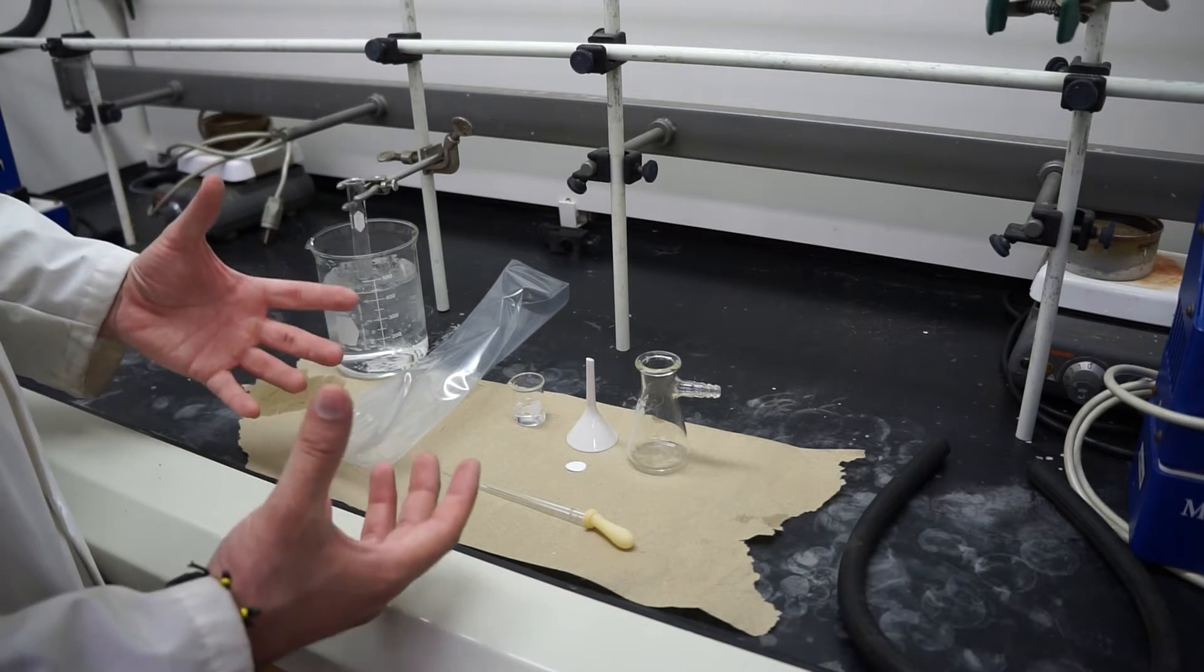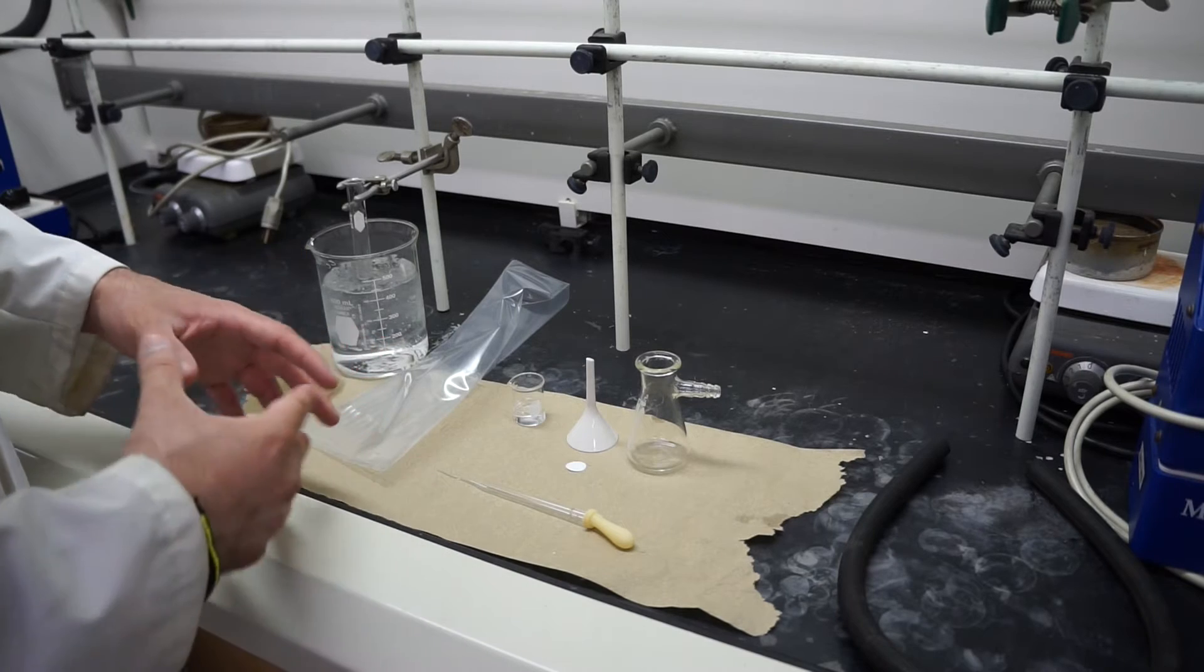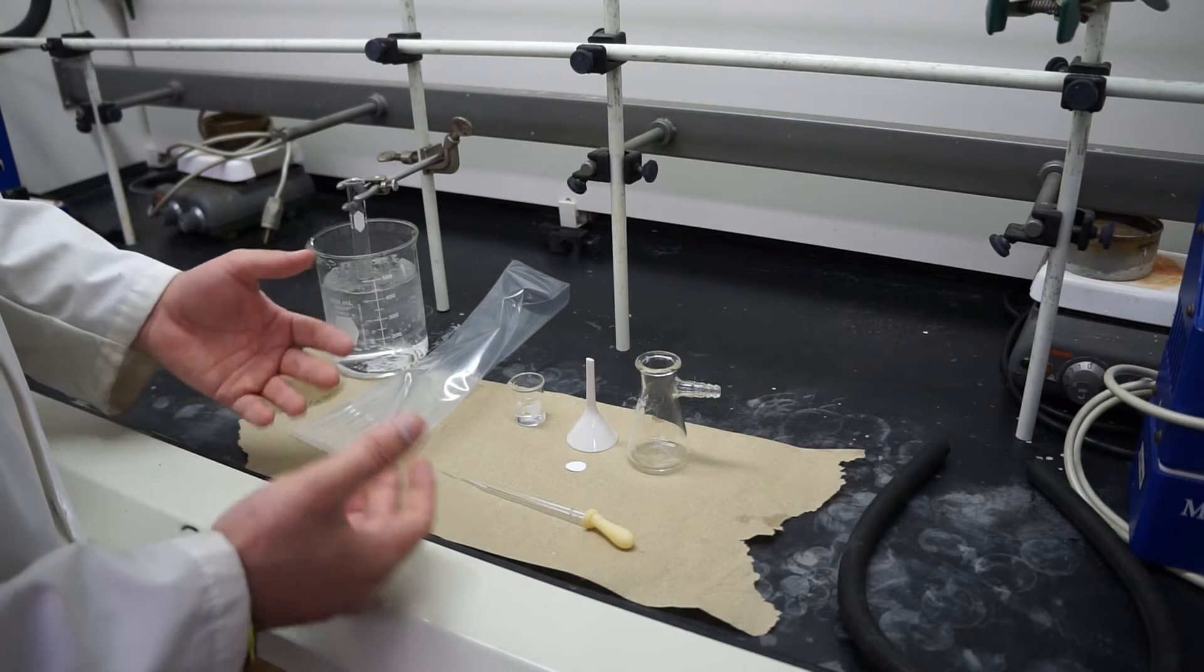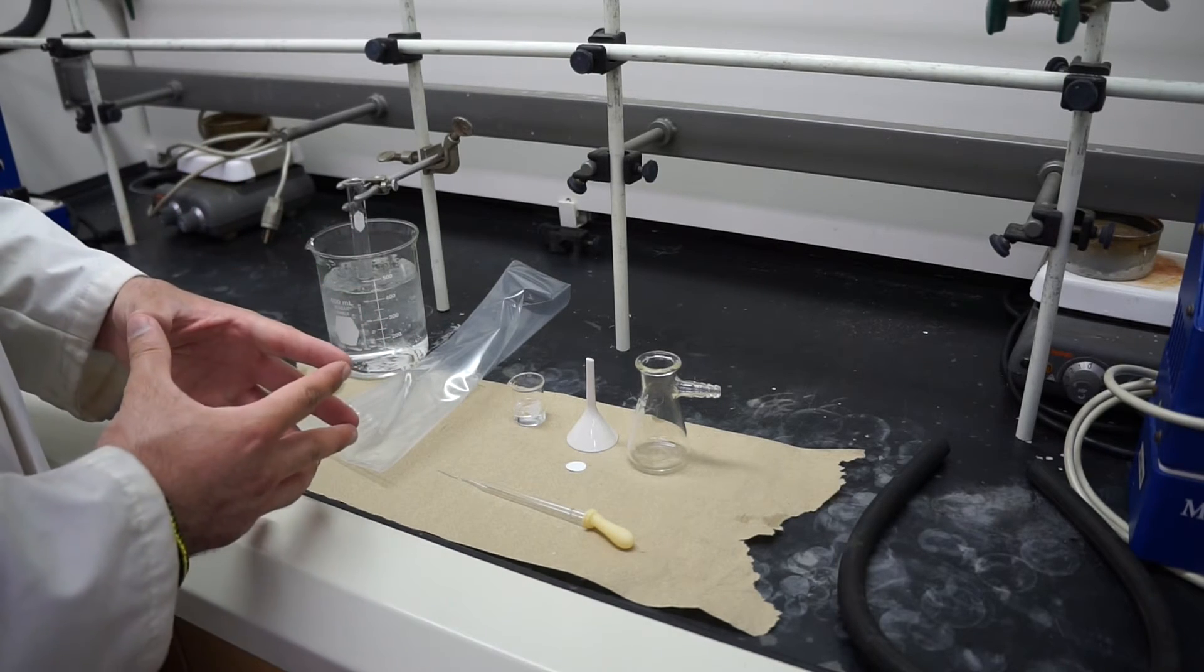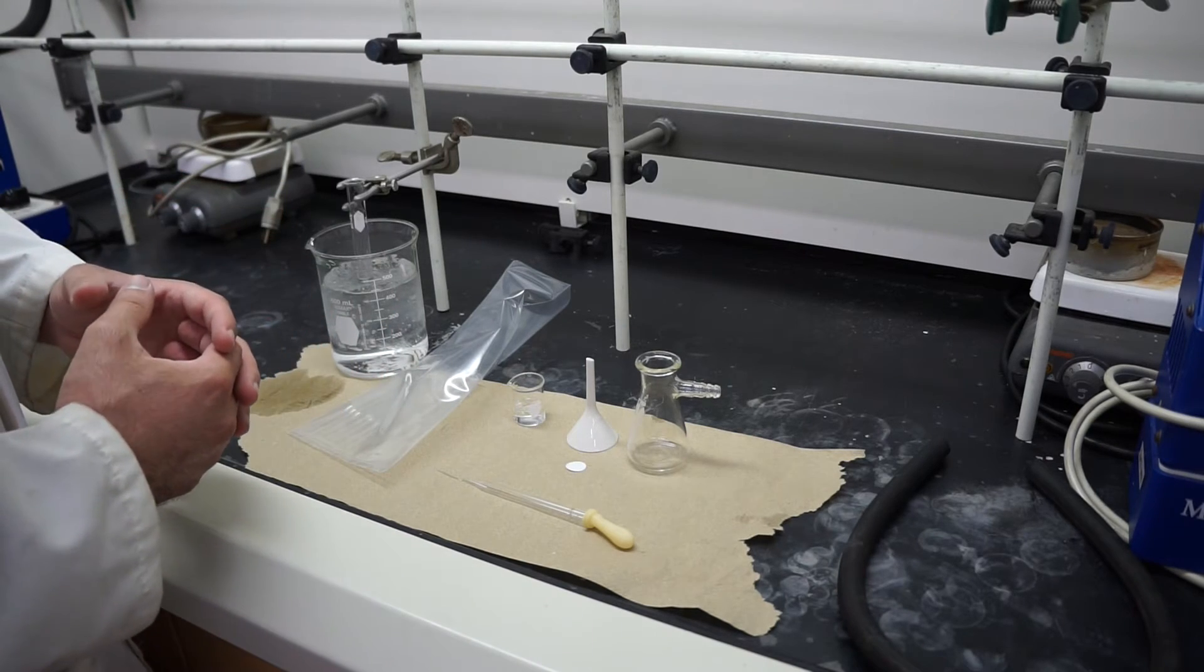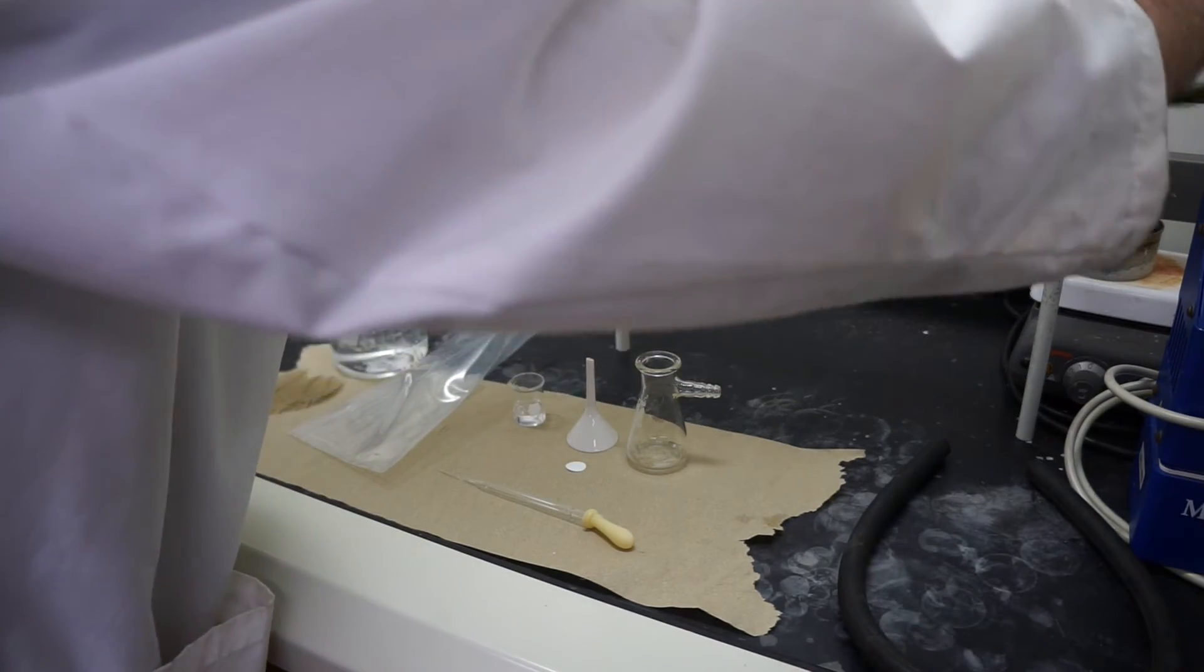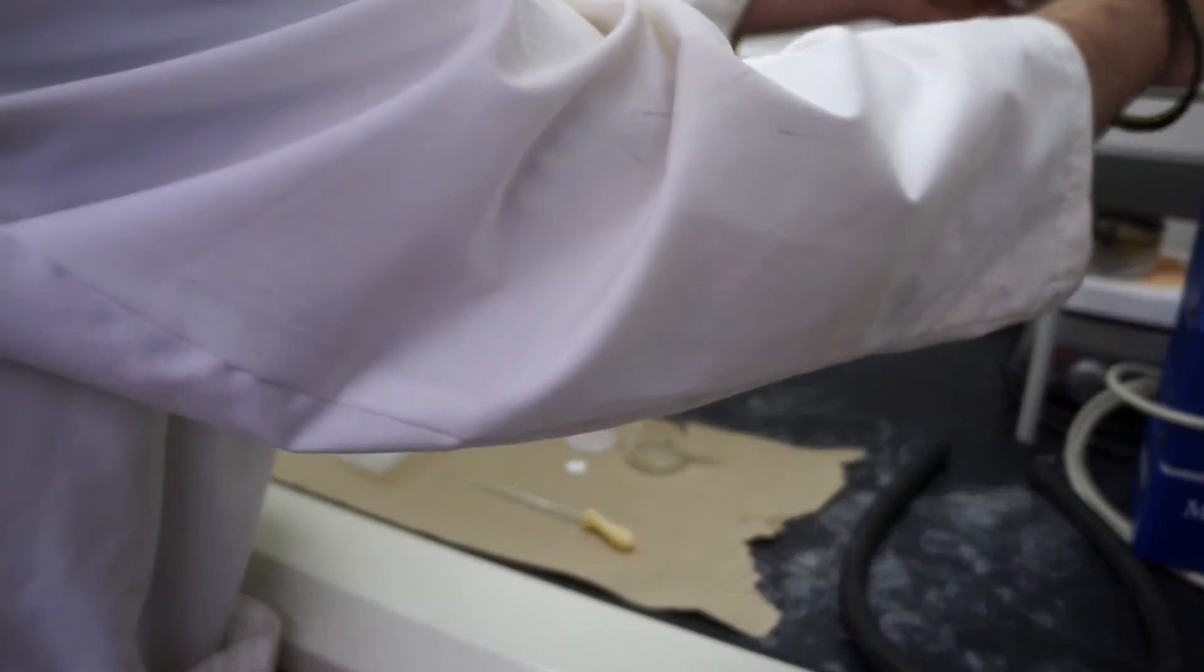With the cold temperature what we're doing is we're reducing the solubility of our crystals, making them come out of solution and crash out and the crystallization should form. After that 10 minutes you are going to do a Hirsch filtration. So we'll go ahead and set up our Hirsch filtration.